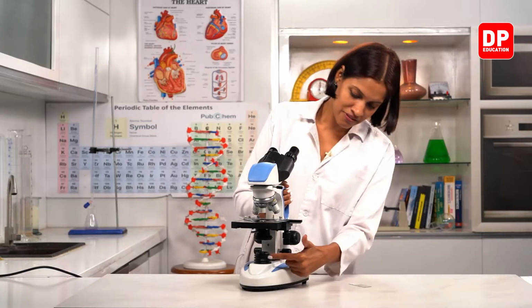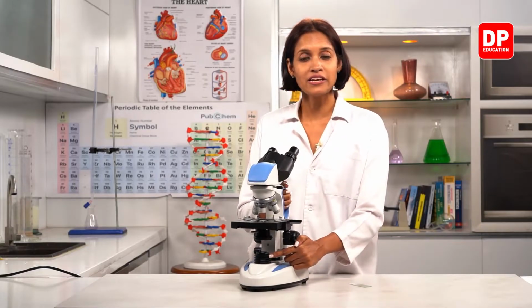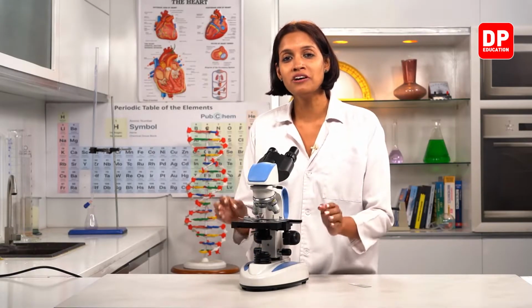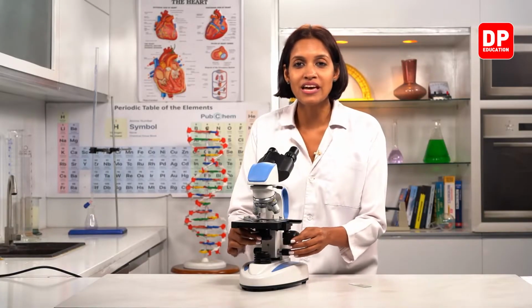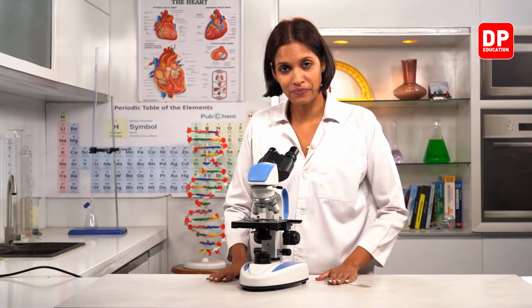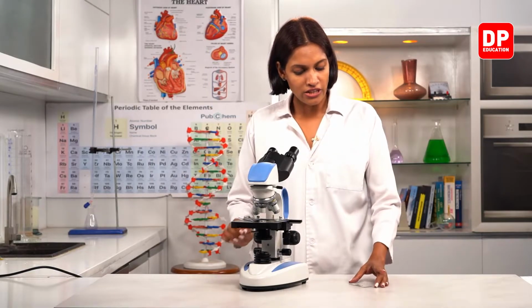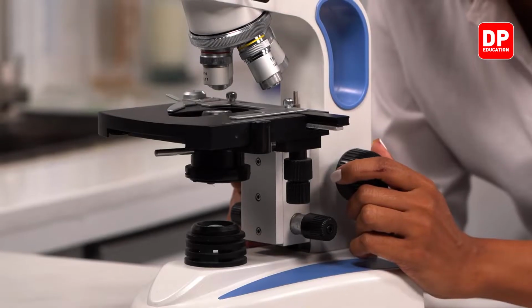No, because we are provided with a light source. Now here you all can see the light bulb, right? So we have a light source, therefore we can skip that step here. And using the diaphragm, we can adjust the amount of light that is coming towards the specimen. Right, children? Now what we need to do is, we have to look through the eyepiece.